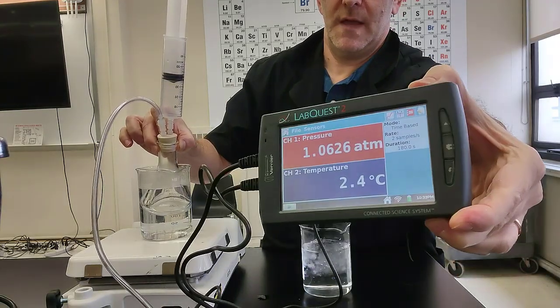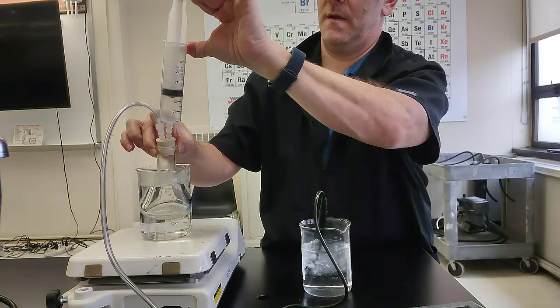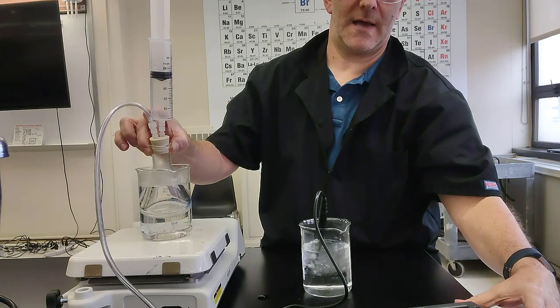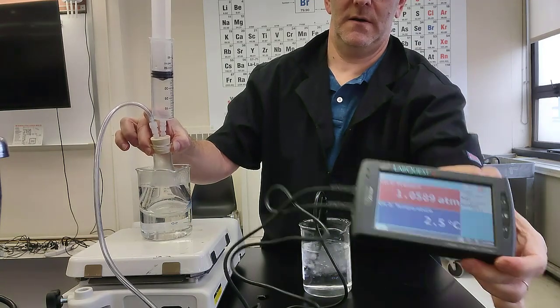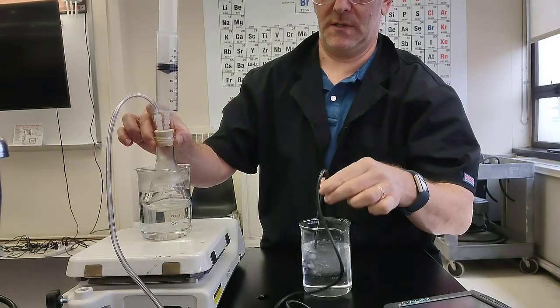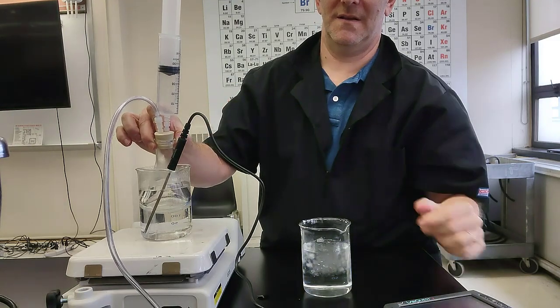Our pressure, again, is holding right at 1 atmosphere. And as the gas in the syringe gets hotter and hotter, still right at 1 atmosphere. Ignore the temperature because the temperature was in the ice bath. Move it over to the hot water bath.